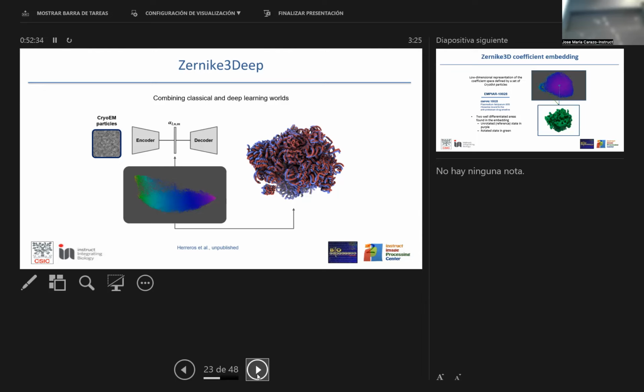And you are completely correct that many times we go to the microscope, we take images, and we take one set of images with one specimen. It's not enough. Clear. Yeah, we're finding this too. It's not enough. We need more microscopes now. So, or better samples, right? No, better samples. The problem is that you are studying the system, so complete reproducibility in the system is something that you may not have achieved yet. Eventually, when you study this enough, you may achieve complete reproducibility.